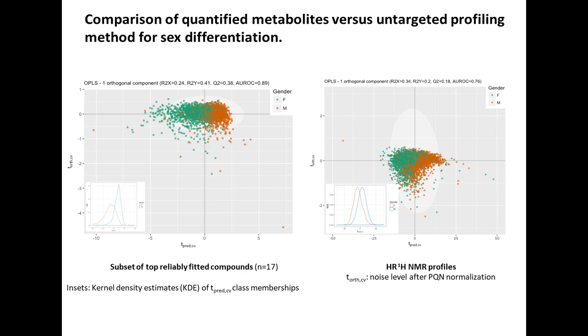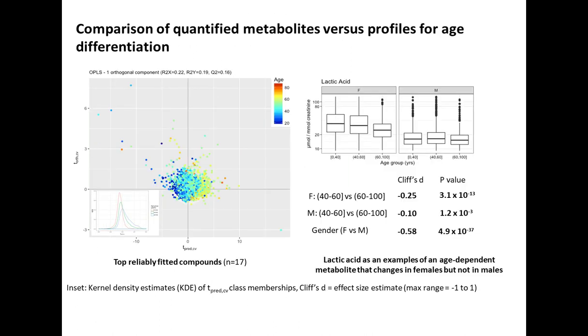One thing that's missing in the literature is a really comprehensive validation of physiological variation. Here you see gender differentiation. This is based on 6,000 individuals, and from these 48, actually only showing 17 here, of the top 17 differential metabolites, you can see strong differentiation between males and females, and you can look at the distributions here.